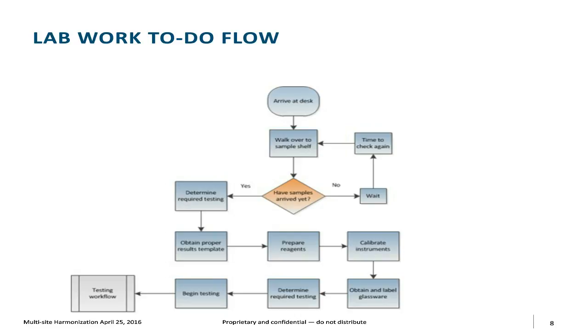And we walk over there, and usually the people from the sample prep groups or sample delivery groups have put samples in these shelves. We kind of look through these samples, and we figure out which ones we want to work on. We take them to our desk. Or they walk over there, they get in the early morning, they look, and there's nothing in those bins. The sample delivery people haven't shown up yet.